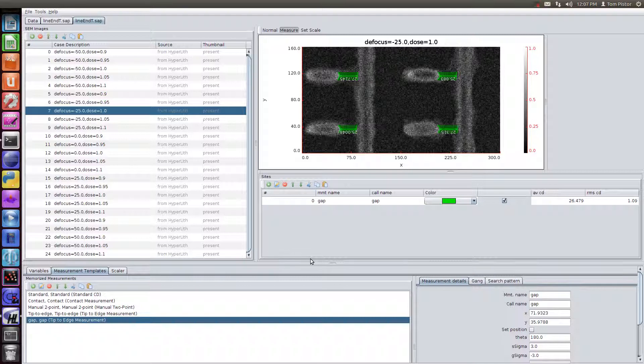So to summarize, this program is called Pan SIA, Panoramic SEM Image Analyzer. And it can be used to measure both the experimentally measured SEM images or the simulated SEM images from the SEM simulator in Hyperlith. And if you're doing resist calibration, and you've got lots of data to process, this is a good tool for that.